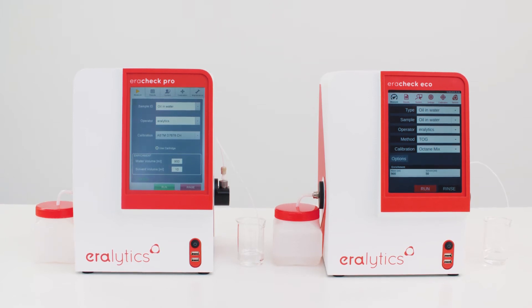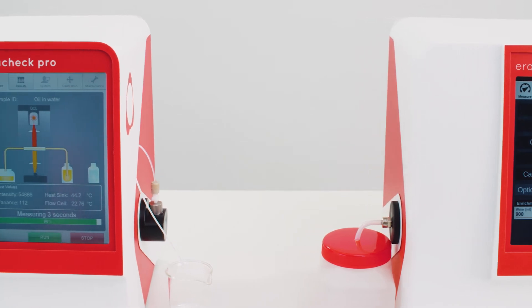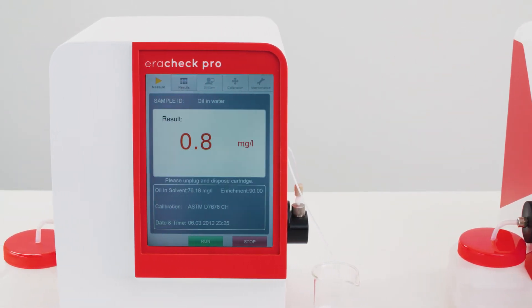eracheck is available in two versions – eracheck eco and eracheck pro, which reaches even lower limits of detection than eracheck eco.